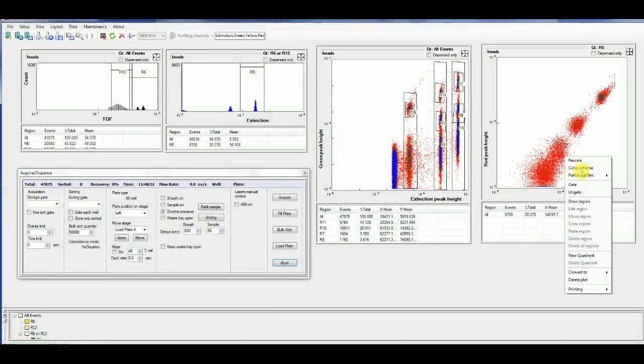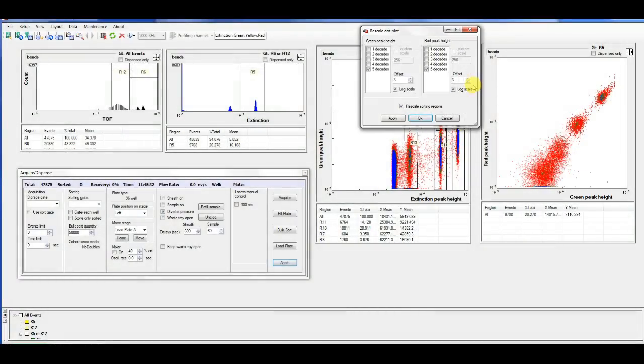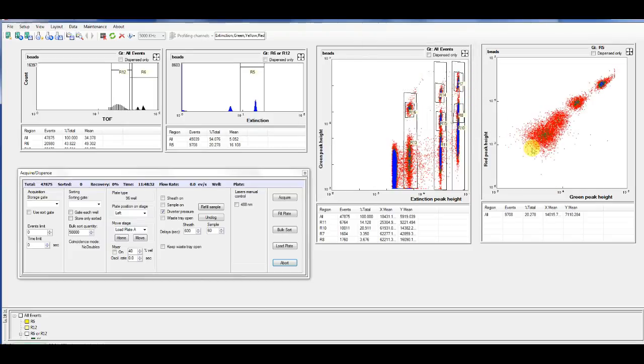Sorting is based on user-selectable criteria, utilizing Union Biometrica's dynamic FlowPilot software for instrument control, data acquisition, and analysis. Define and manipulate multiple independent graphical and statistical displays of acquired data, including multiple regions per plot, custom scaling, and logical gating options.